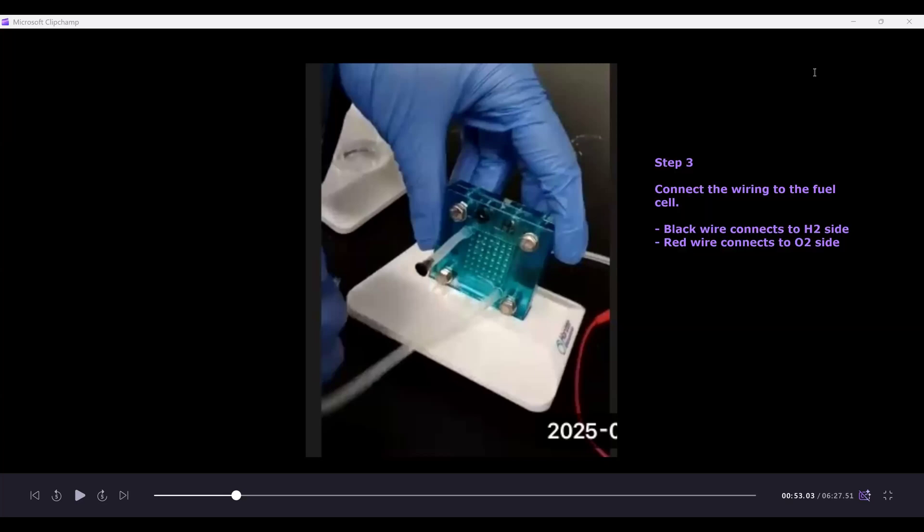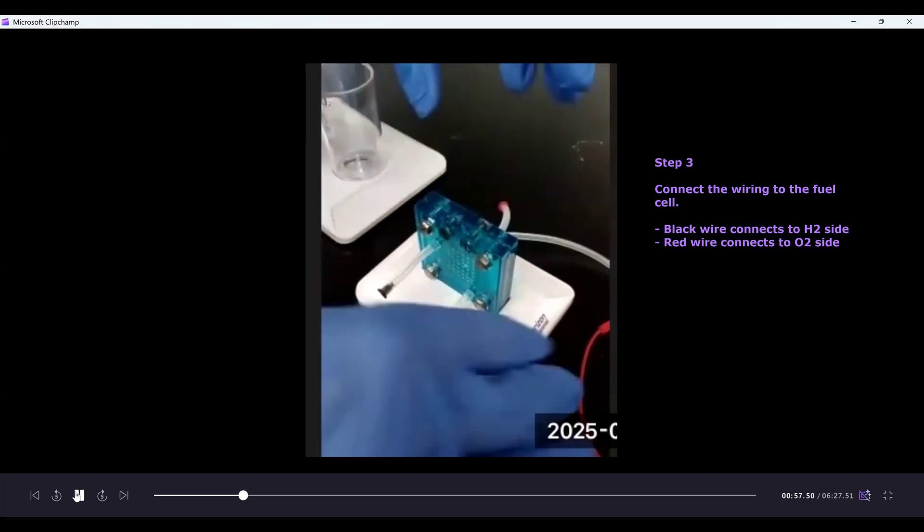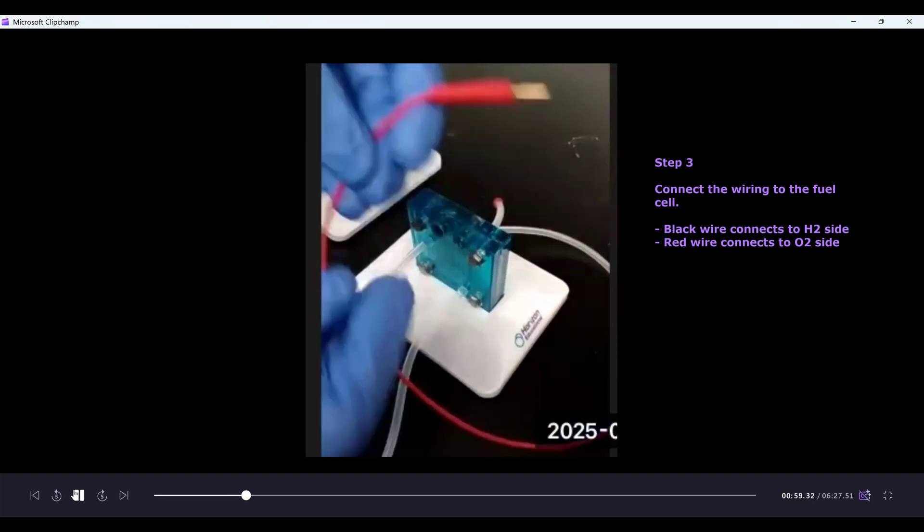Step three is connecting the wiring to the fuel cell. This is color coded: the black wire connects to the hydrogen side and the red wire connects to the oxygen side. It is very important that you connect the correct wires to the correct sides.